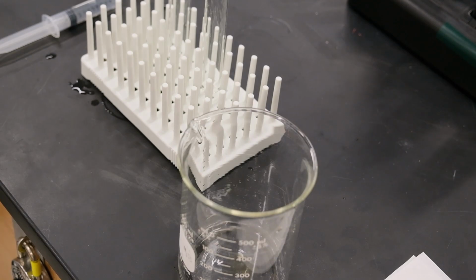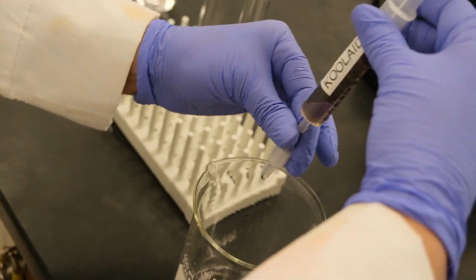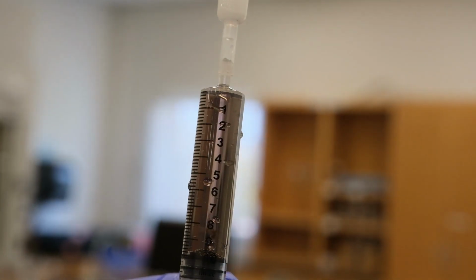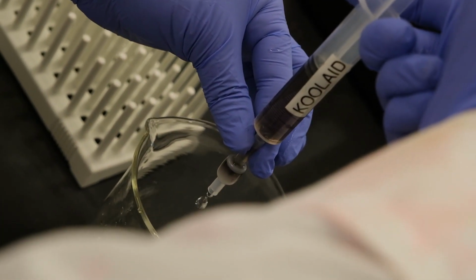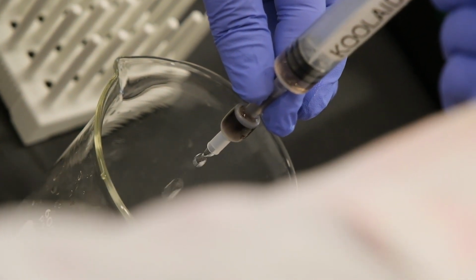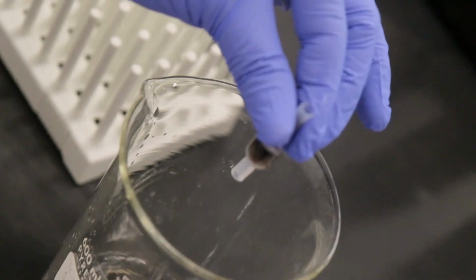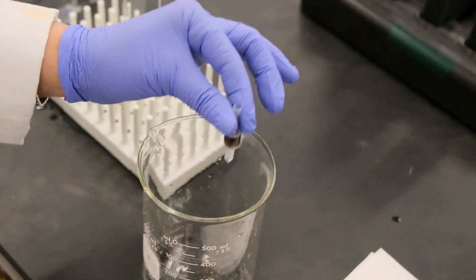Then we load our Kool-Aid on the column. So that we double check there is a 10 milliliter. We load it. And as you can see, it stays on top of the column. Once we have done that, this is our Kool-Aid, whatever you have chosen.